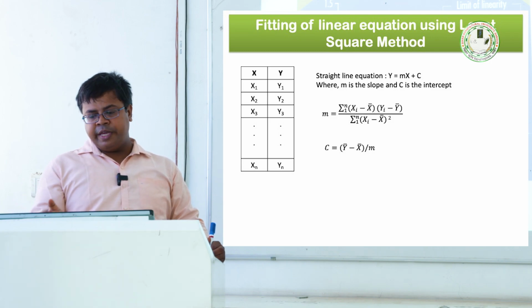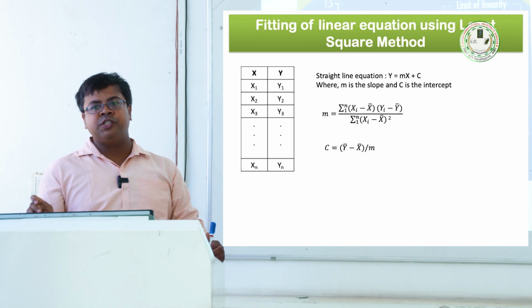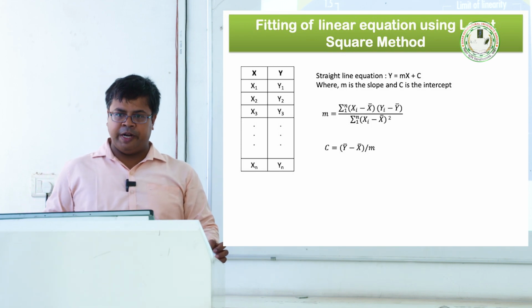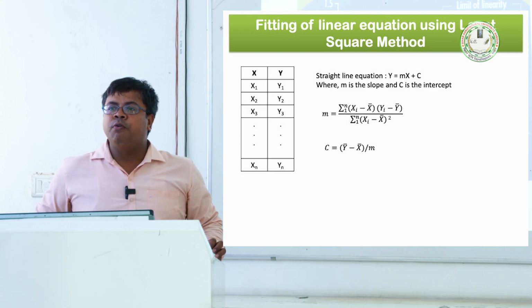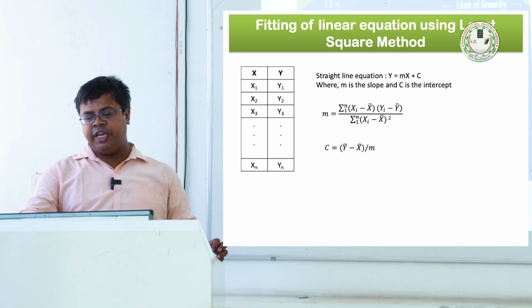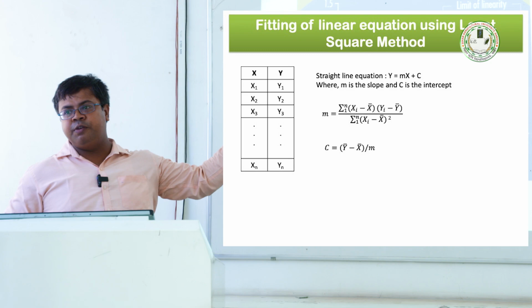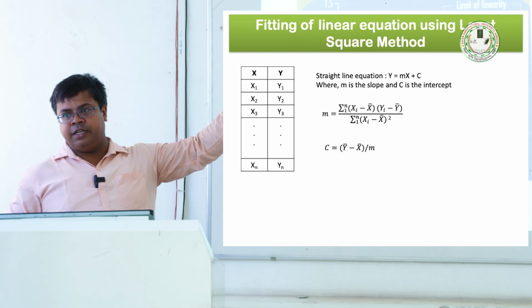Okay. Now what happens at higher concentrations? The linearity will break. Okay. So in that particular case where the linearity breaks, or where the curve changes its curvature, is called the inflection point. Inflection point is where the curve changes its curvature. Okay, here you see that at a point it is somewhat curvilinear, it loses its linearity.